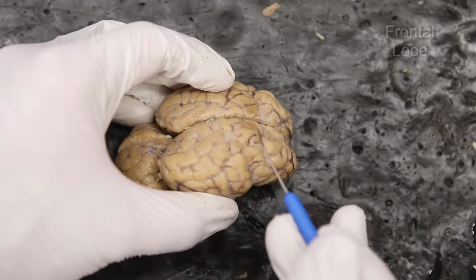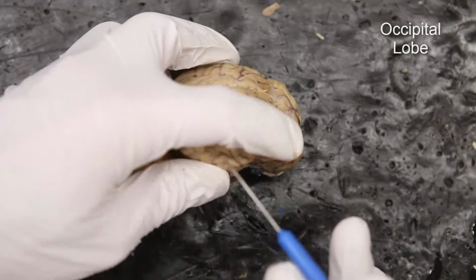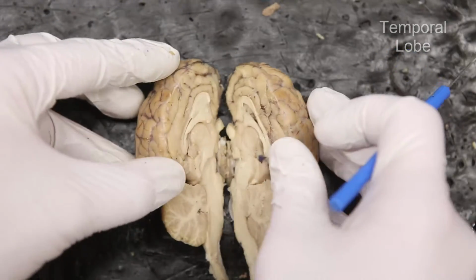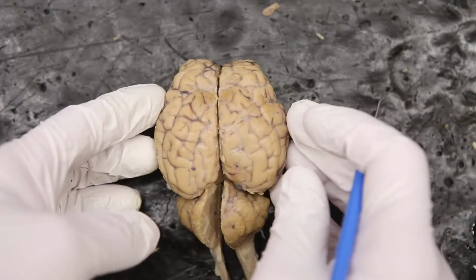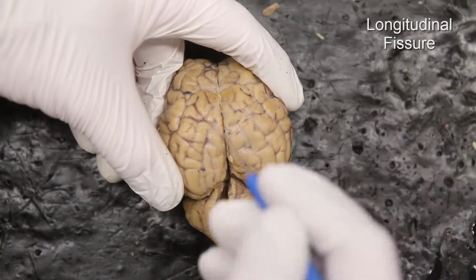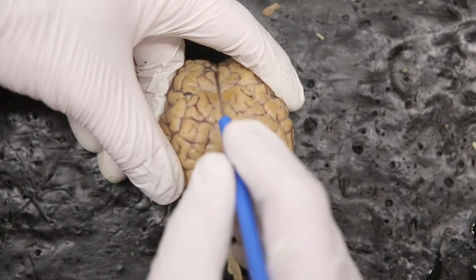Here is going to be the parietal lobe. The back is the occipital lobe, and my thumb is partially covering the temporal lobe. Now, the other structure that is gone because we've already cut this open, so if we put this back together, we're going to see the longitudinal fissure. This indent right here where I cut would be the longitudinal fissure.